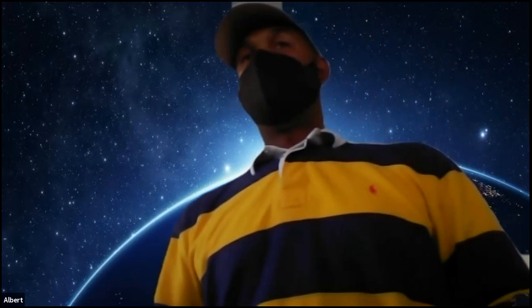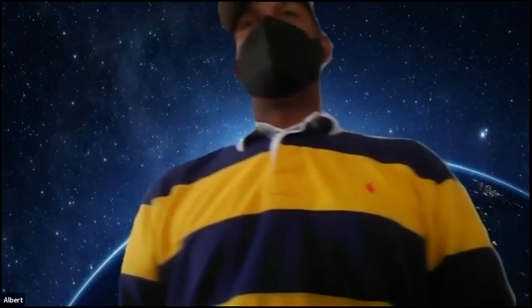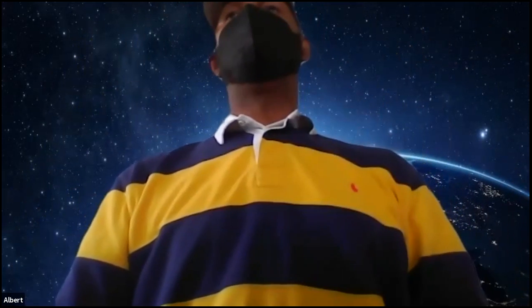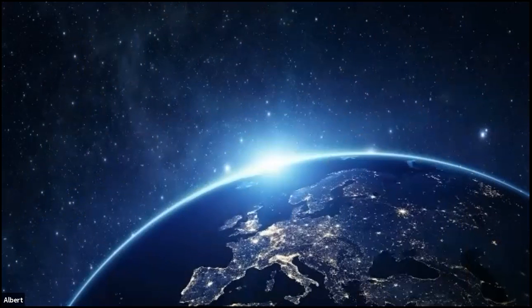You can lift it up and swirl it. Yeah, you could turn the temperature down too. Is it dissolved all the way? Okay, do you have any particles left in there? Nothing. Okay, no solid, take it off. You can turn the outlet off.